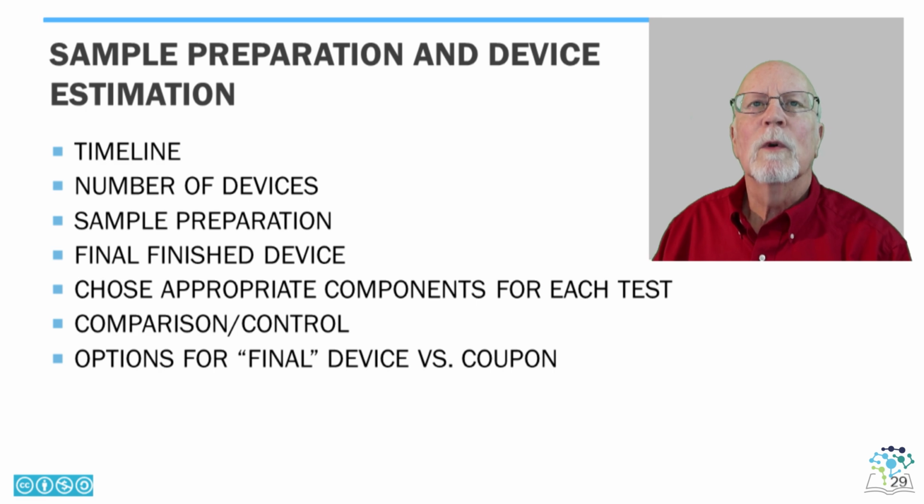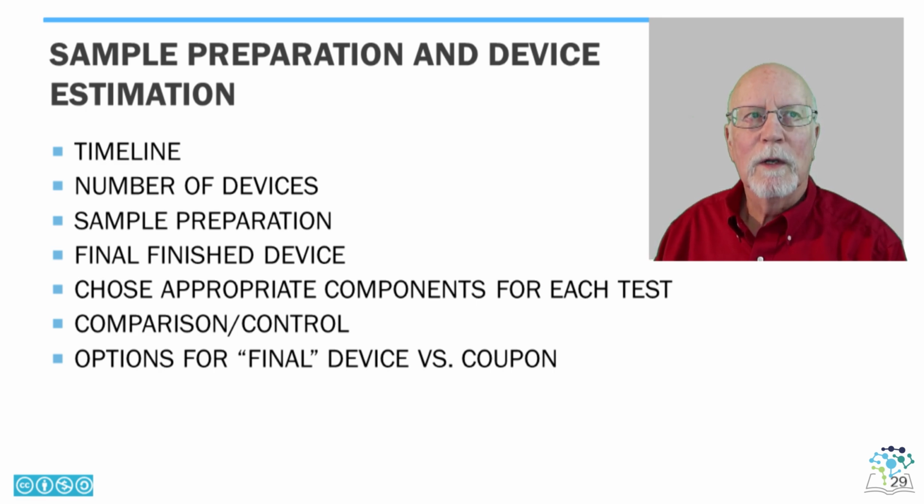These extracts would be assumed to contain any leachable or extractable chemicals from the device components that could interact with the biological systems. These animal models are then exposed to the extracts by appropriate routes and dosing, and the results read out after the appropriate duration, from overnight up to 26 weeks.